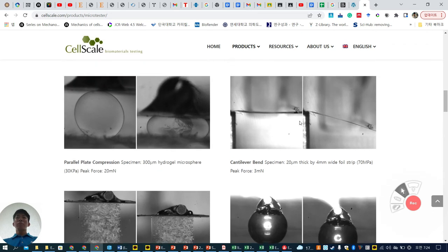Yeah. 요거는 그러니까 이거 없이 그냥 이렇게 니들만 니들로 누르는 게 포인트예요. 예, 포인트 컨택한 거죠. This is really needle, like. 이런 거 이렇게 누르는 걸로. Yeah, right. 또 계산하는 방식이 이게 다 프로그램화돼 있나? 예, 프로그램화돼 있어요. 거기서 이제 니들 뭐 클릭하고. 알아서 계산해주더라고. 우리가 복잡하게 막. 네.